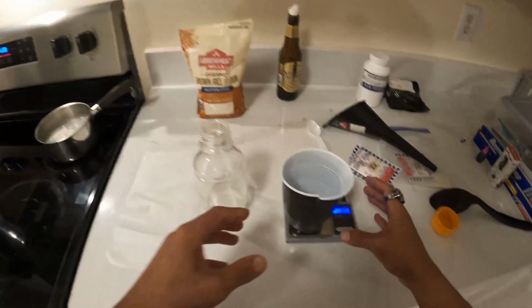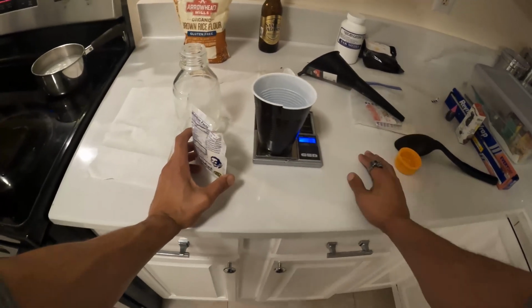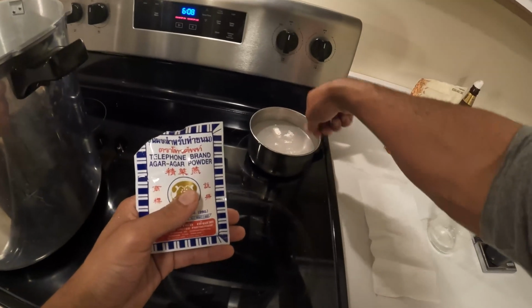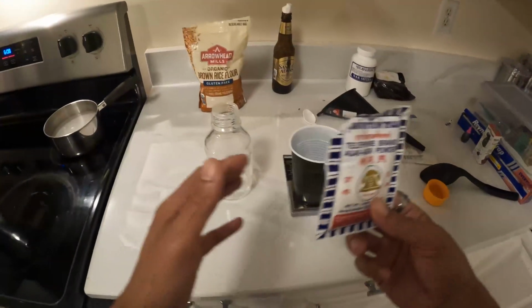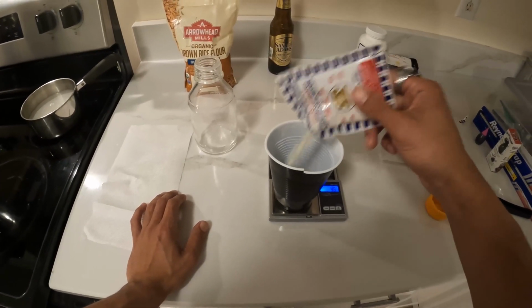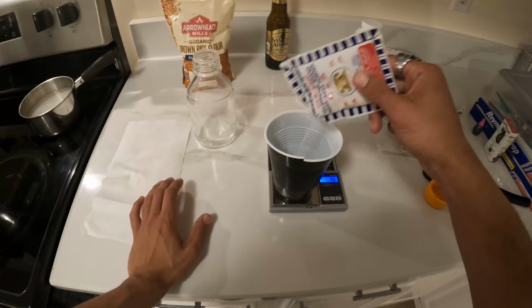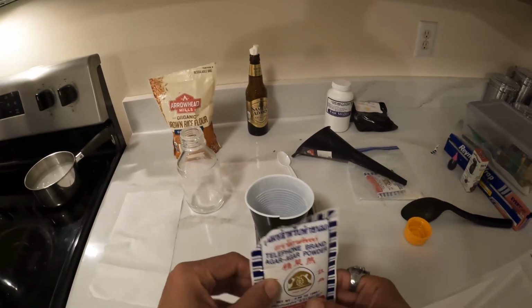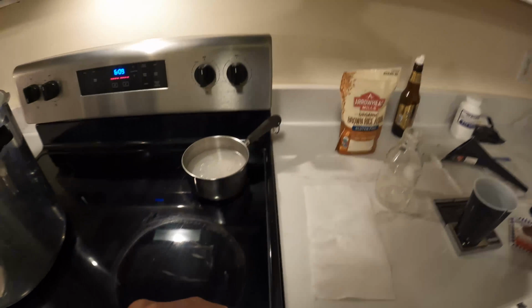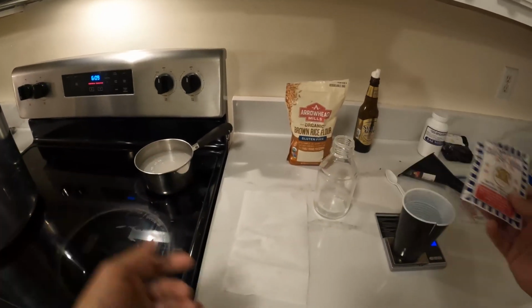Now I know I mentioned I like to sometimes do a little bit less to make a softer agar, as in like 8 grams. But if you're going to do it on the stove top, you're going to lose some of it on the sides, and you're going to lose some of it on the spoons. So if you're doing the stove top method, go ahead and just add a little bit more. And for me, since I usually do around 8.5 of agar, I'm going to do the normal recipe of 10.5. If you don't do that, what's going to happen is once you lose it and you go to pour your plates, they're not going to solidify. There won't be enough actual agar in there, and they're going to be liquid, and you've wasted your time.